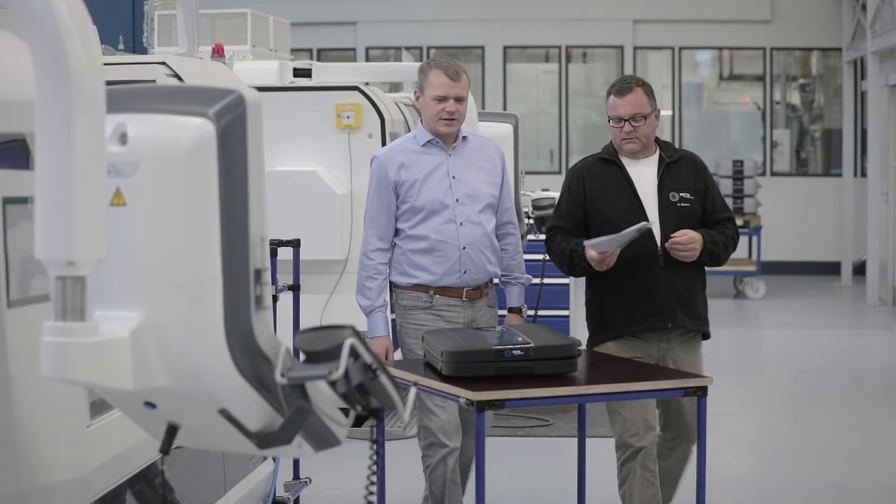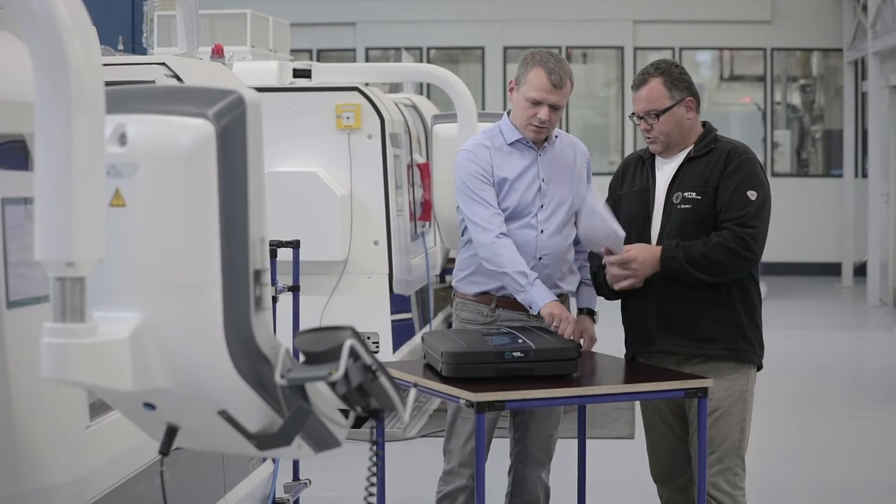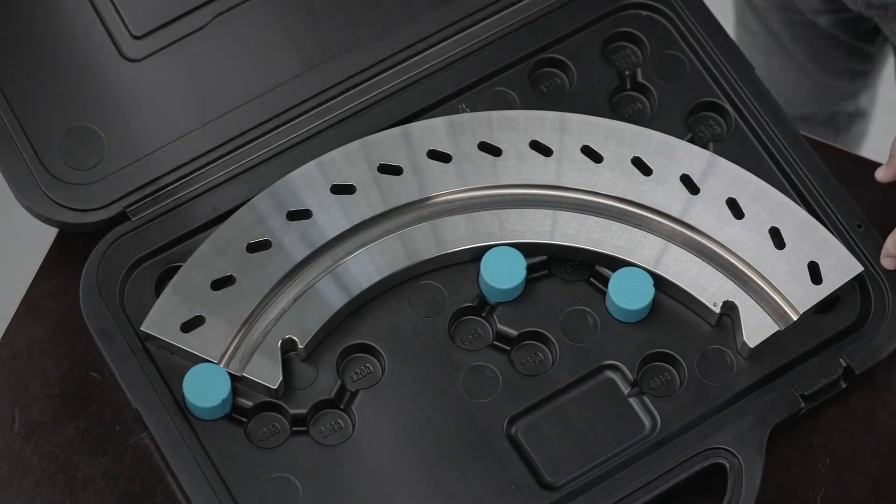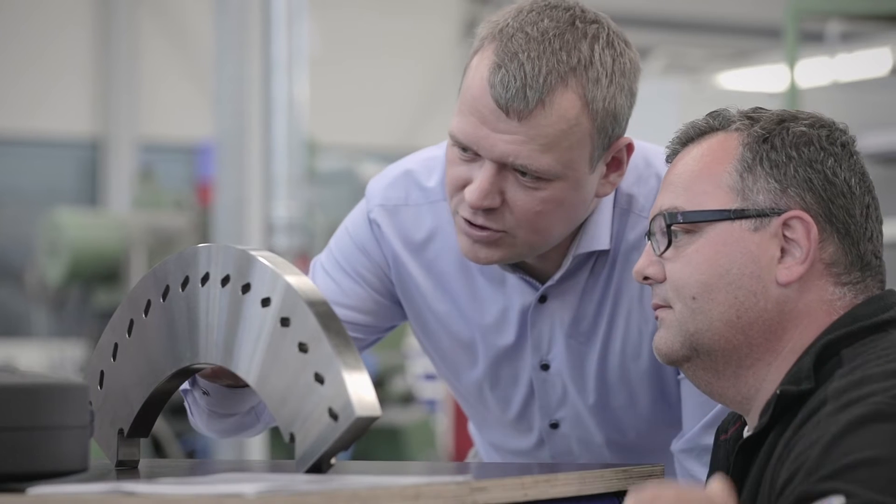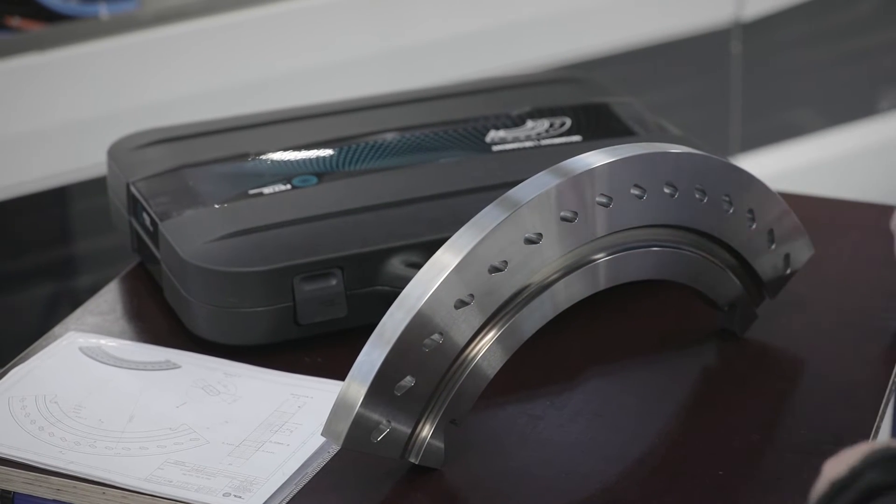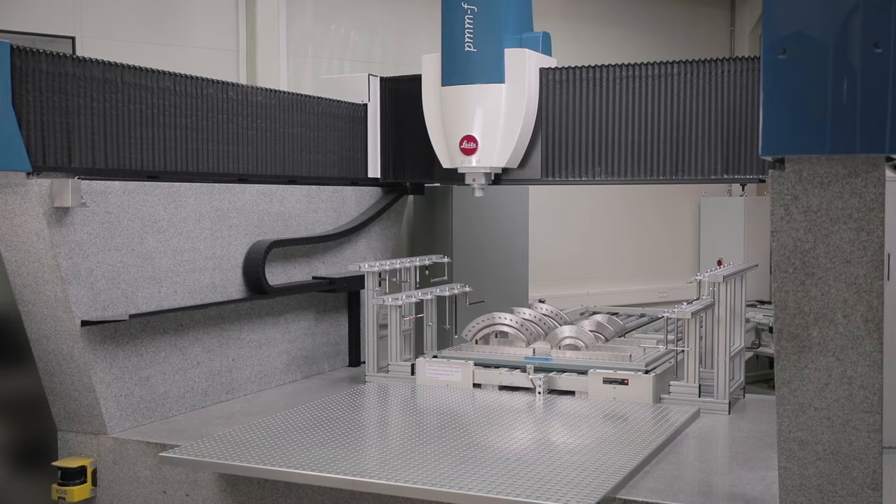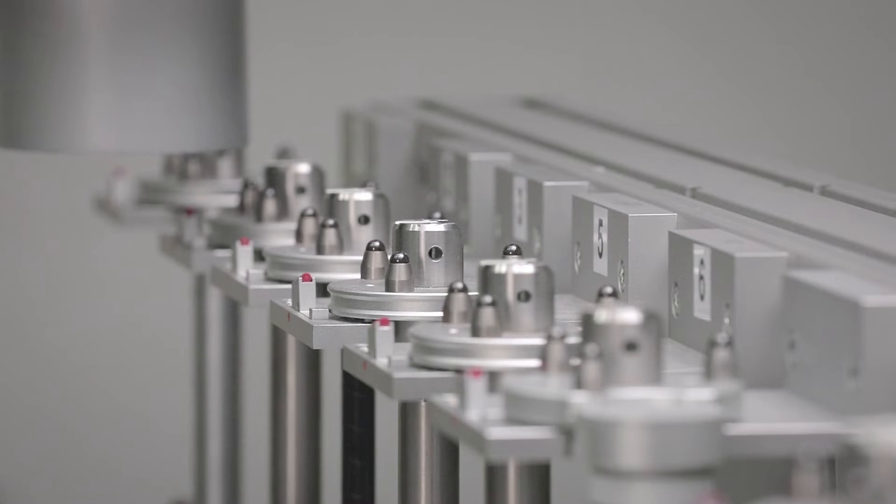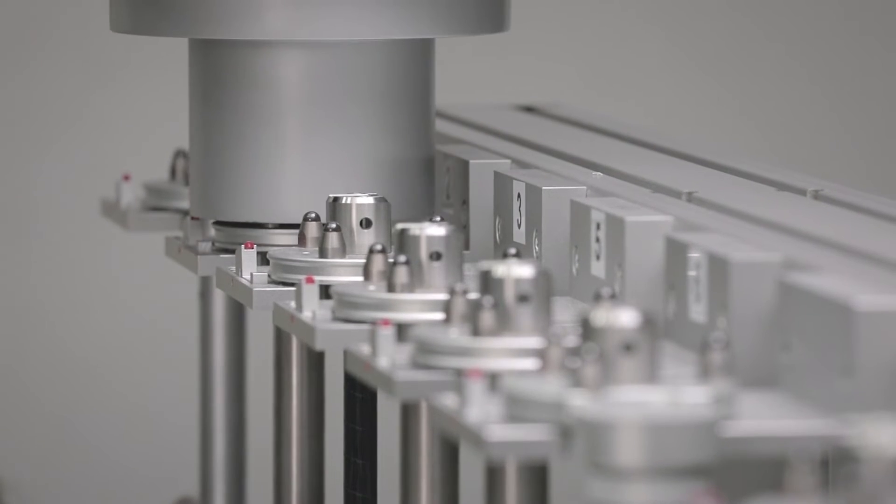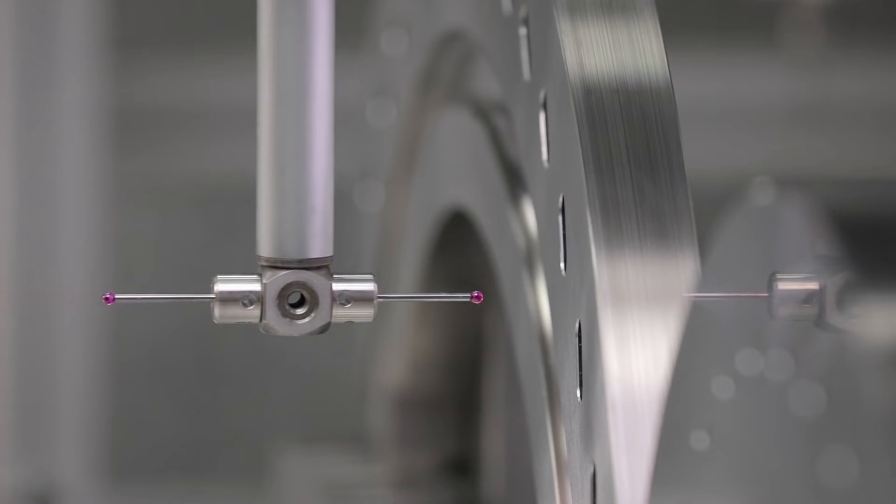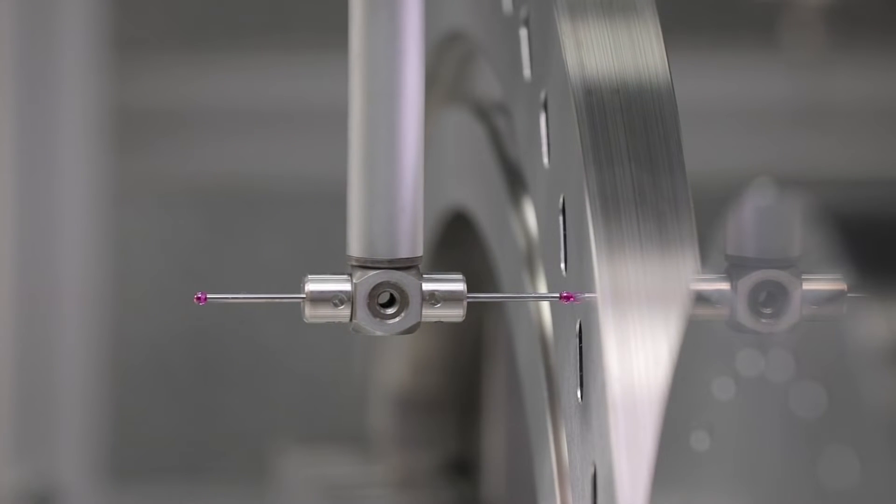Another special feature from our company is the patented segment technology, with which our customers can increase the output of their tablet press by up to 40 percent. This segment technology offers the possibility of having less product loss due to the geometry and shape of the segment, while at the same time allowing the operator to reduce error rates when setting up a machine and of course gain higher productivity.